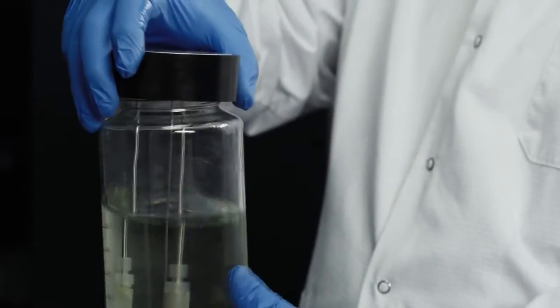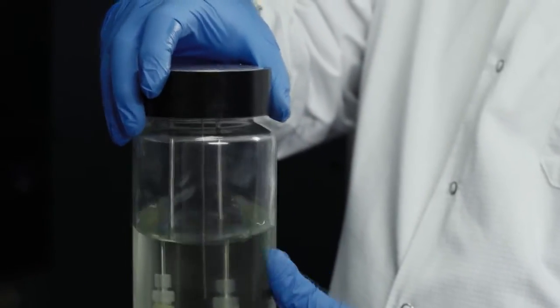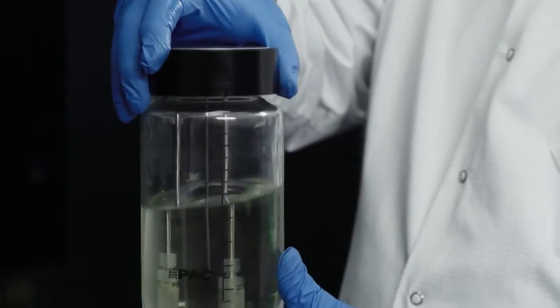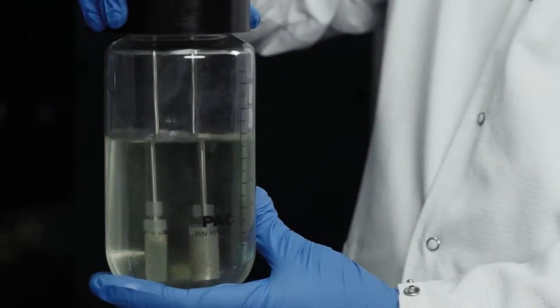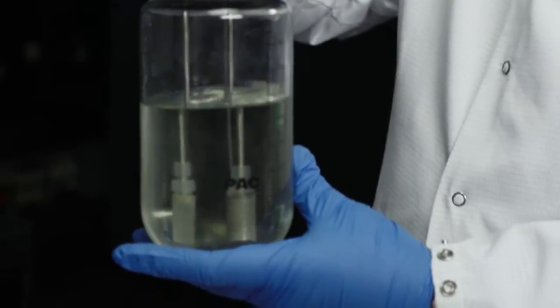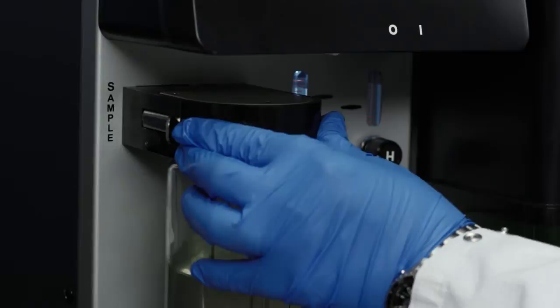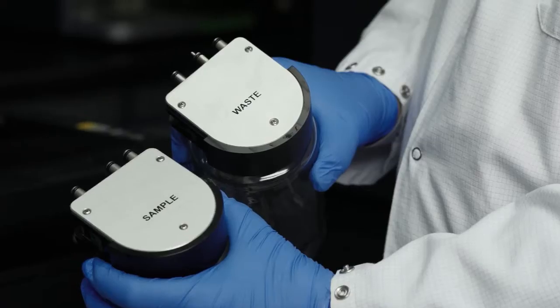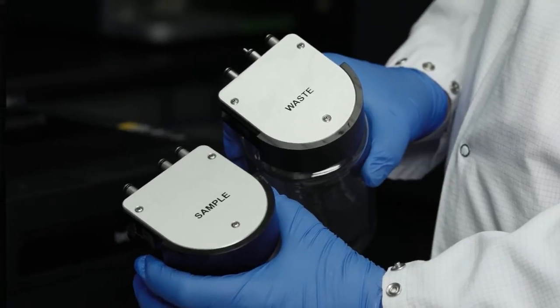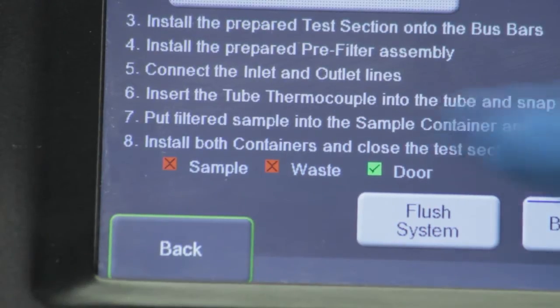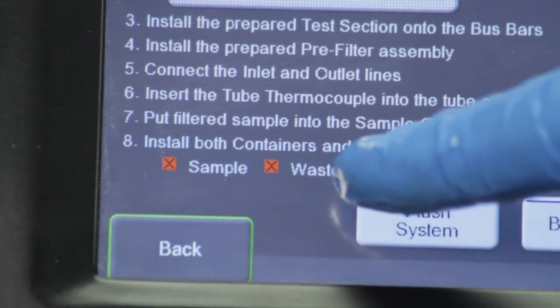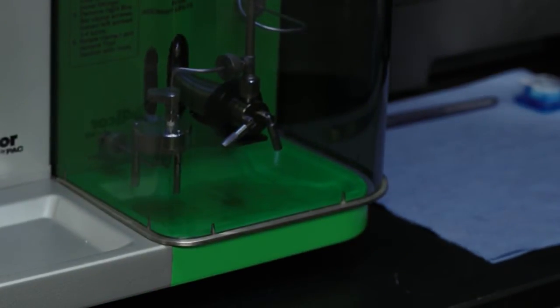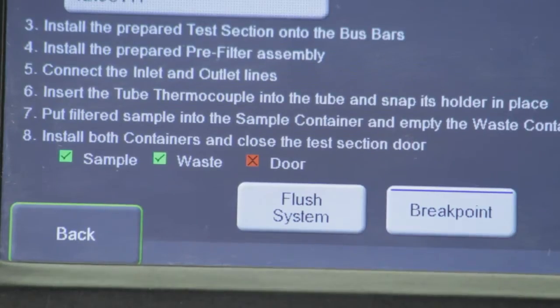By now, the fuel should be completely filtered into the sample container. Attach the sample head to the sample container by lightly screwing the two together. The graduations will always align to the front. Then, insert the sample and waste containers and heads into the respective slots in the unit. The heads are indicated to prevent incorrect installation. Connections to the sample container and the waste container are indicated with a check or an X. Close the test area door. The door status indicator will change from a red X to a green check.